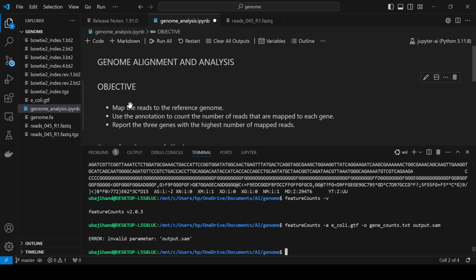Oh, it has not seen this. I think this is where the problem is coming from.